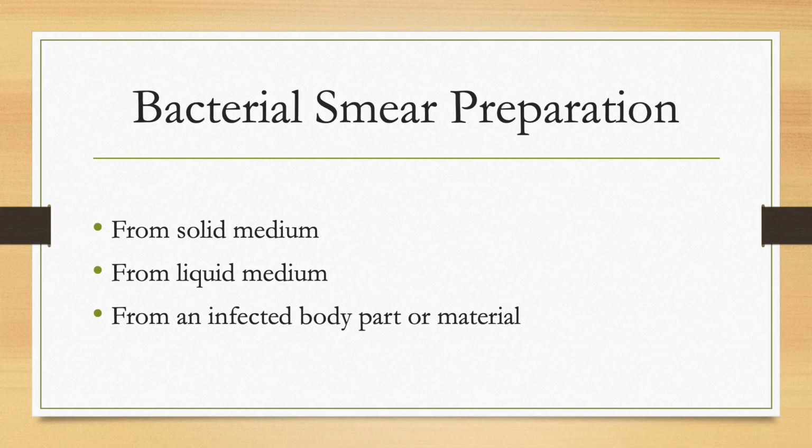Okay, so before you're able to look at your bacteria under the microscope, you first have to place them onto glass slides. And the process of doing this is called bacterial smear preparation. You can do this on a variety of samples.